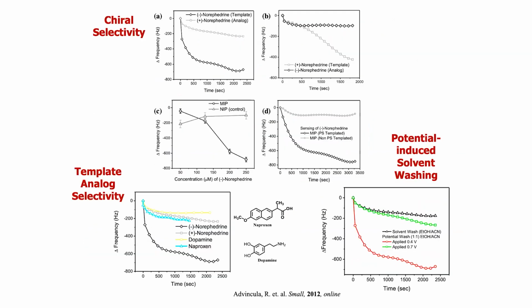In these binding assay studies, the chiral selectivity was demonstrated by the high frequency shift. That is, if we look at the assay, a large delta in frequency indicates the binding of the drug or this analyte on the MIP produced substrate. Between the two enantiomers, we get, of course, the opposite effect. That is, if we use one enantiomer, the other enantiomer is not so selective.